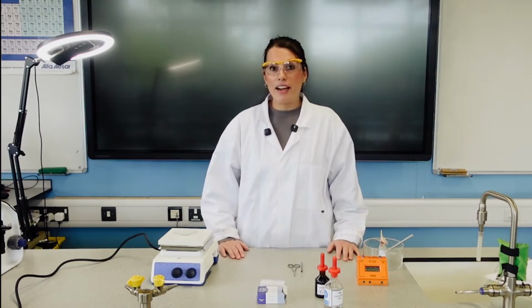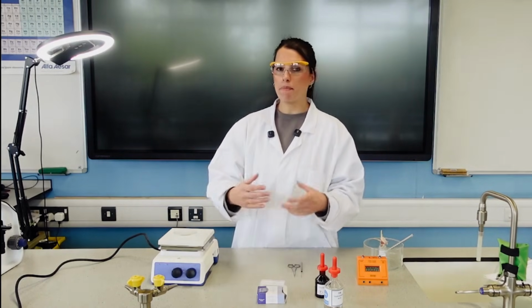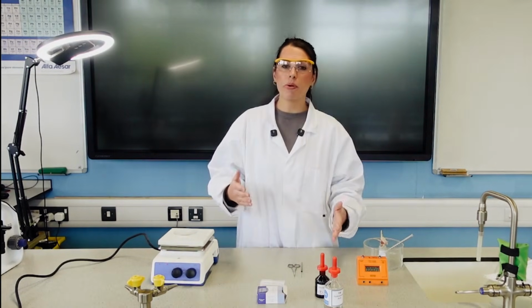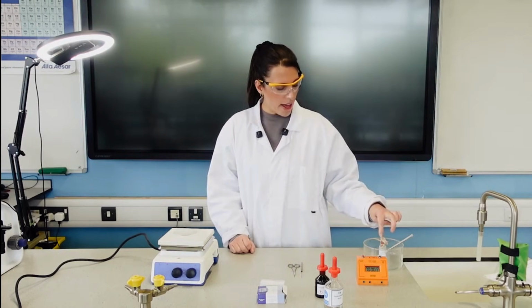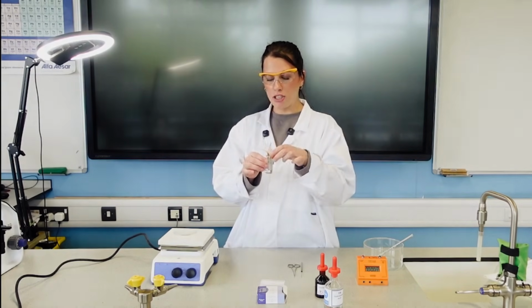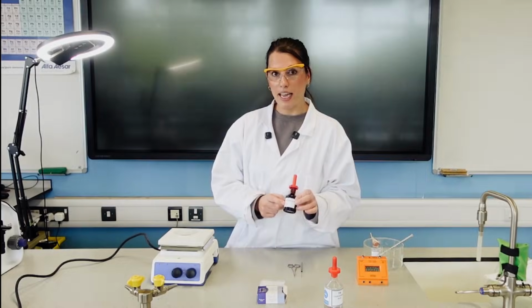So in terms of the variables for this investigation, it's not really one where it's a quantitative experiment where we're getting a quantitative result of an endpoint of reaction. We're more interested in seeing the actual stages of mitosis. However, there are things that we could control if we were going to compare maybe two different plants, for example. So we need to make sure that we are going to be using the same age garlic each time. Ideally, it'd be from the same garlic, same age. We'd need to leave it in the acid for the same amount of time. We'd need to use the same volume and concentration of our stain as well.